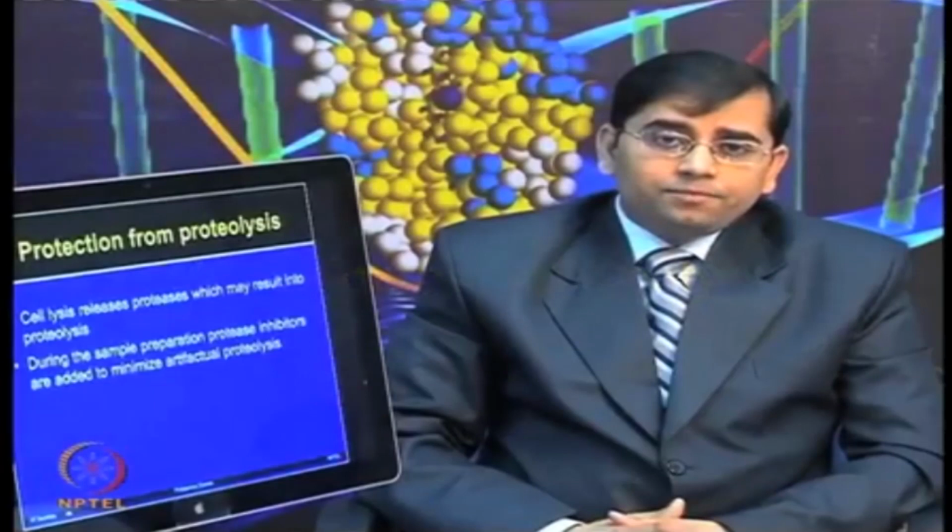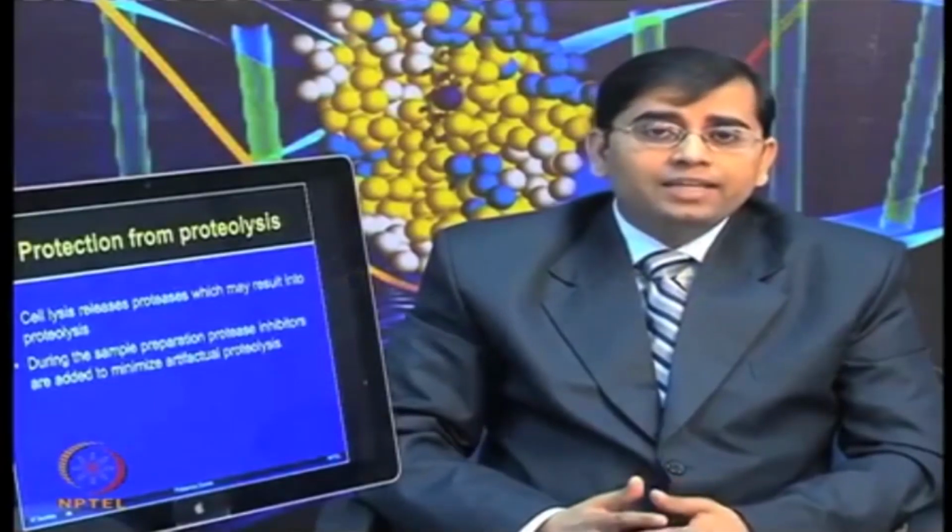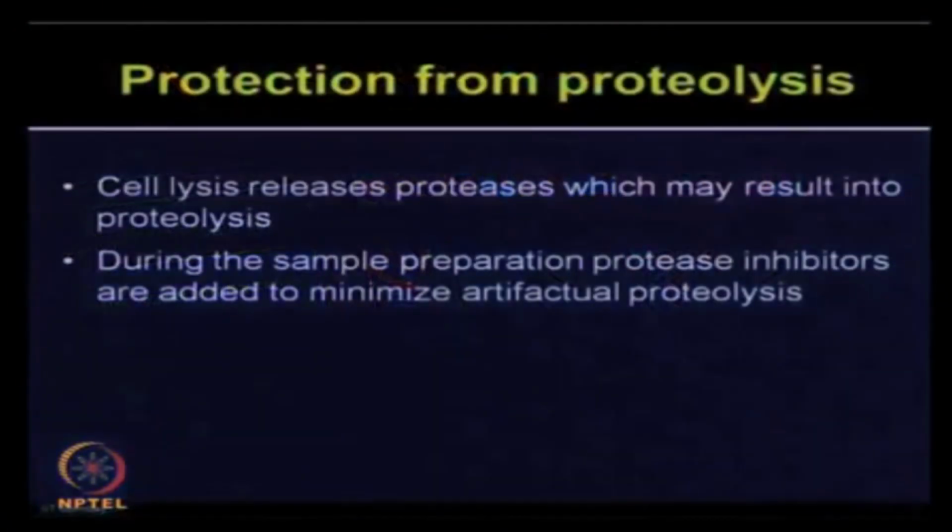Cell lysis will release various proteases which may result in proteolysis. During sample preparation, one can use different types of protease inhibitors which can minimize artifactual proteolysis.